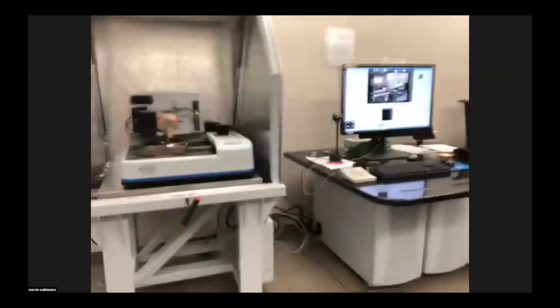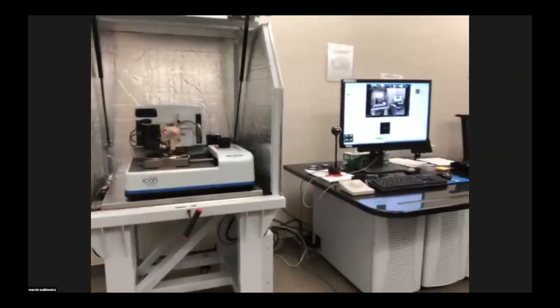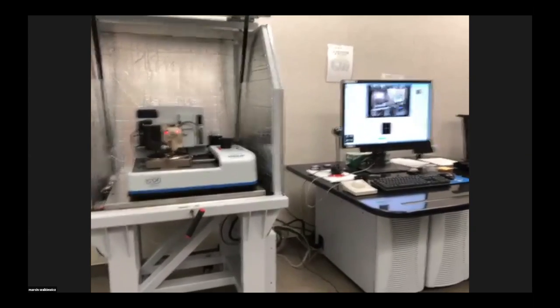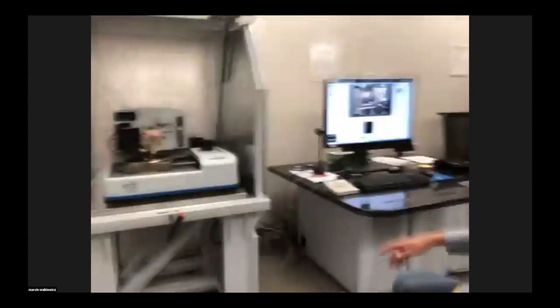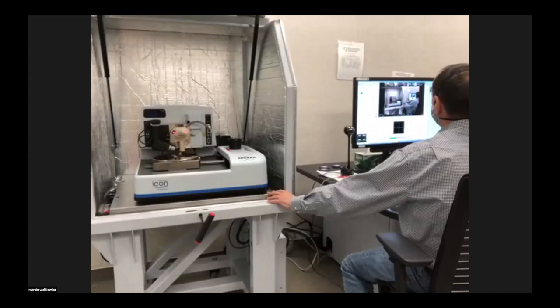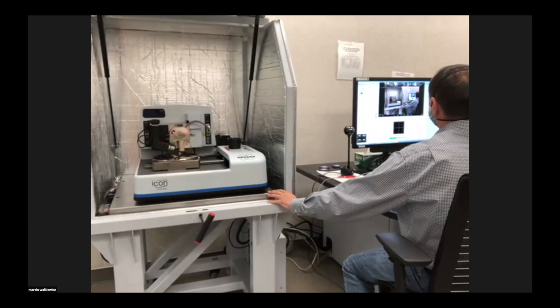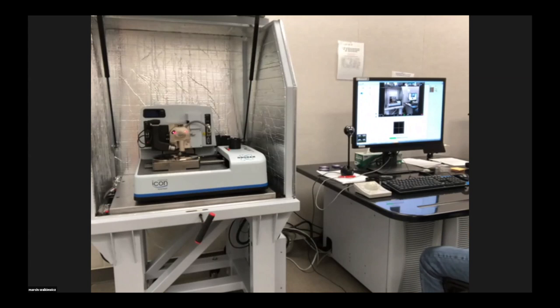And just for context, I wanted to point out that the actual AFM is just the little thing that's sitting inside of the box. So the box on the outside is actually to help with stabilization and any sort of vibrations. Right, this is a floating table. Yeah. So this thing is isolated from the ground, and that's how we don't have any vibrations.